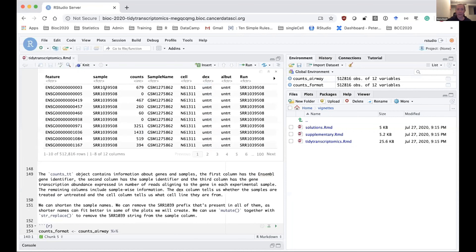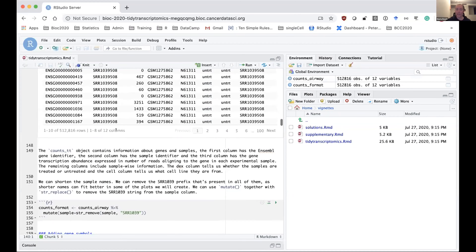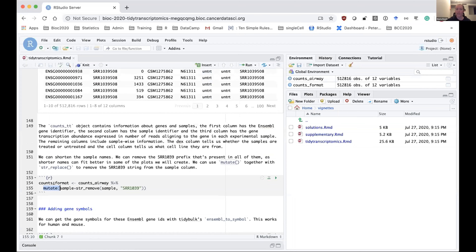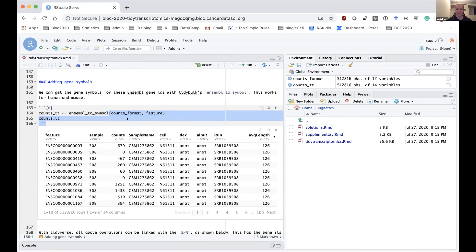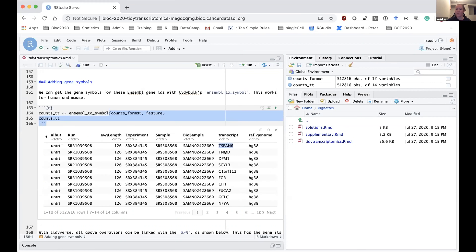We're going to do a little bit of formatting. All the sample IDs have a prefix SRR1039, followed by the unique sample identifier. I'm going to strip off that prefix using a standard tidyverse mutate function, which adds a new column, using string_remove to strip off that prefix. Next, I'm going to get gene symbols, which I can do very easily using tidybulk's ensembl_to_symbol function. That works for human and mouse, and it gives me gene symbols for my Ensembl gene IDs, which we'll use in some of the plots.